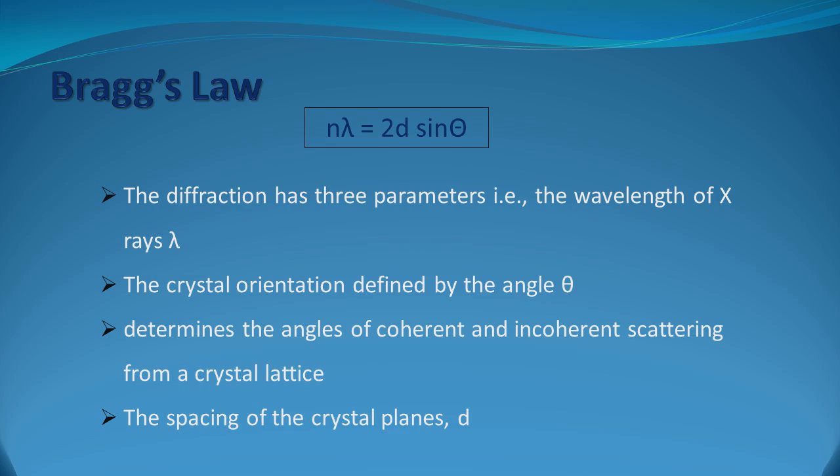And d is the distance between the planes of the crystal.